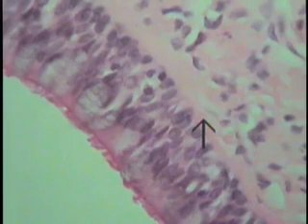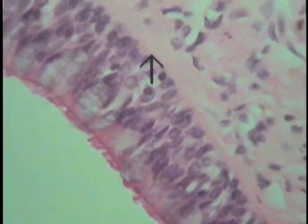Also, one can make out the little mucin granules of goblet cells, and one can more easily see the three layers of cells, a columnar epithelial profile here, if one compares it to the profile of the nucleus. A little rounded group of cell nuclei here, and another cell layer here, these so-called basal cells. Nonetheless, all these cells reside on the basement membrane located here, so it satisfies the definition of being a simple columnar epithelium. So it's given the name pseudostratified columnar.